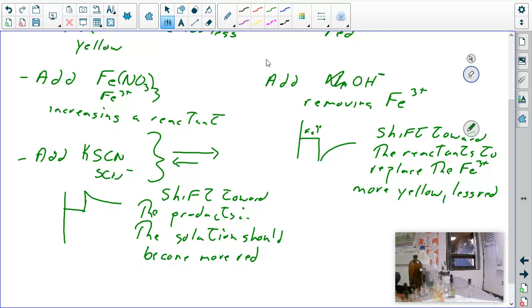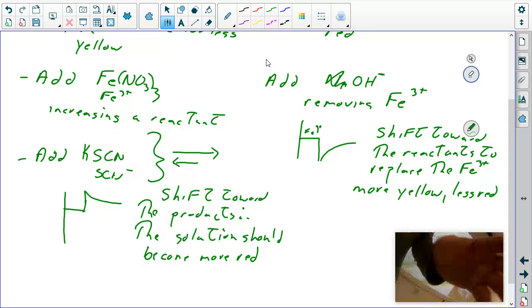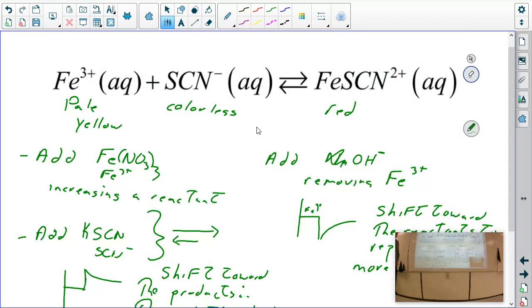Maybe if I add more sodium hydroxide to that, maybe I'll get a different red color. But that's what experiments are for. What happens when we do the experiment. Now we had 7 very conclusive experimental results on this and 2 not so conclusive, possibly because my eyes aren't good enough to pick out colors too much. That could be me.